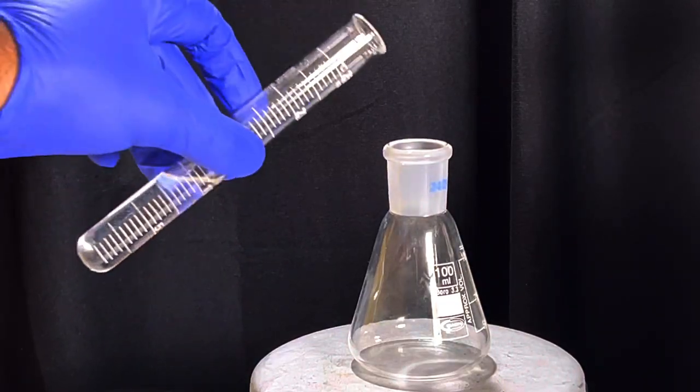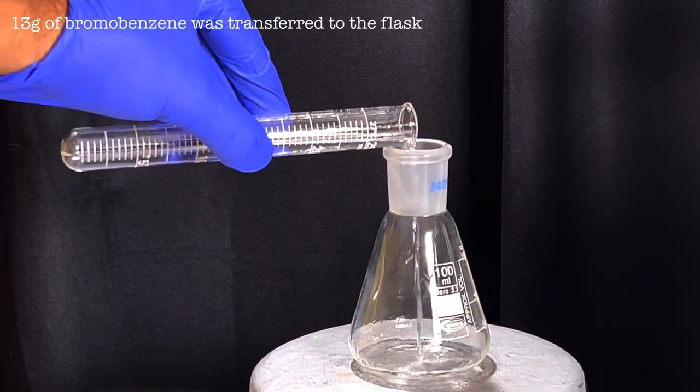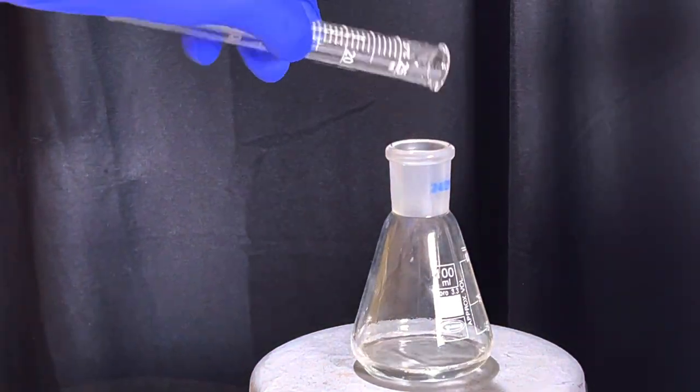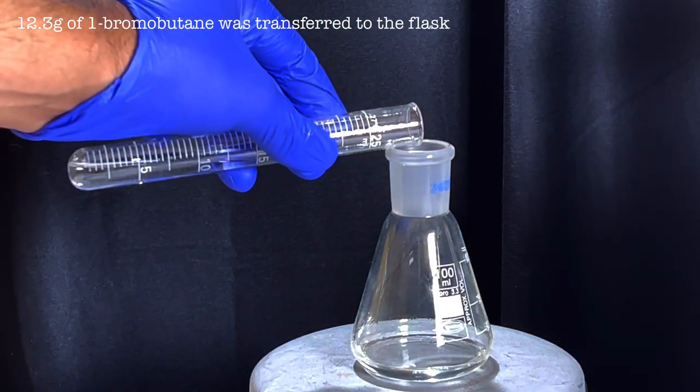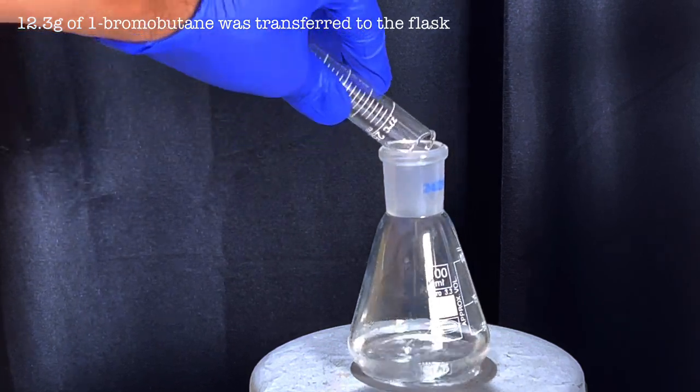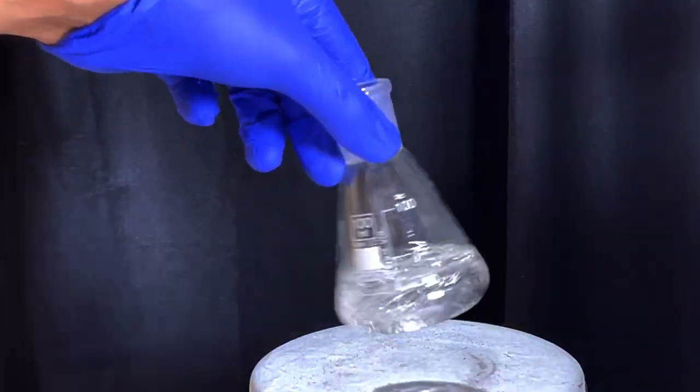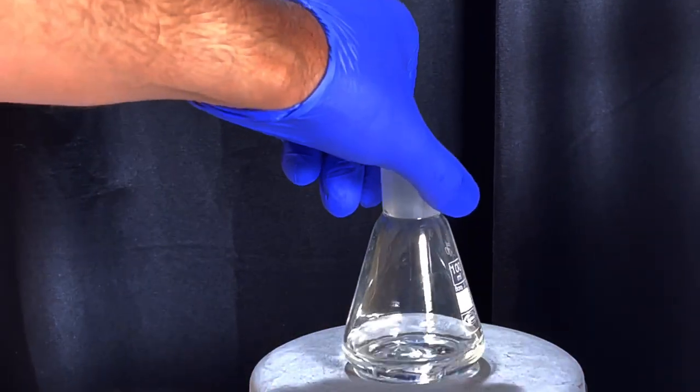Start by taking a 100 ml Erlenmeyer flask and add 15 grams of bromobenzene to it. Then add 12.3 grams of 1-bromobutane. Shake the flask to mix the contents and it will result in a clear solution.